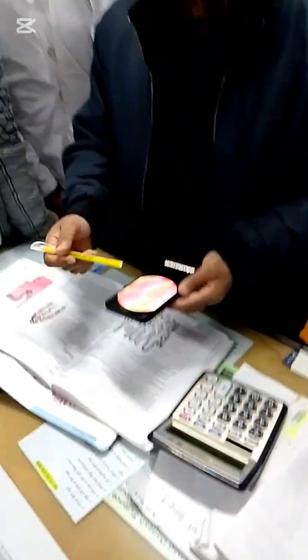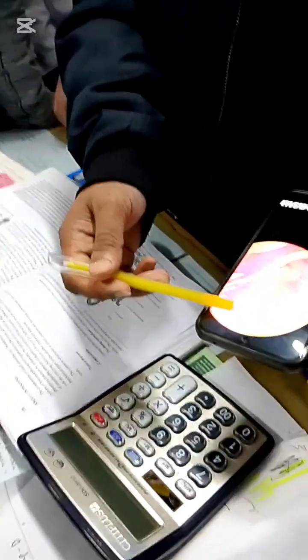If we give the indicator here, you have to write down gastric pit. This one is gastric pit. These are gastric glands. These are gastric pits. As you can see here, gastric pit.